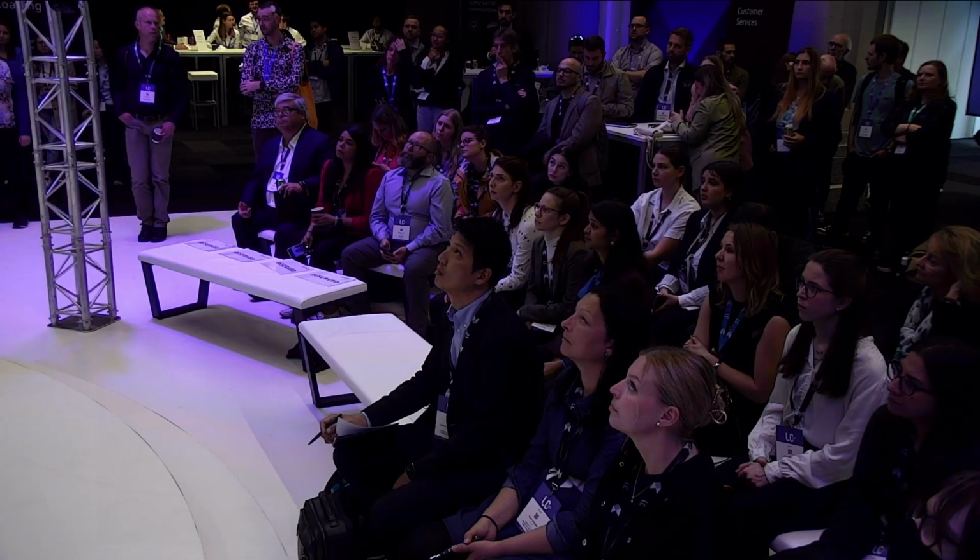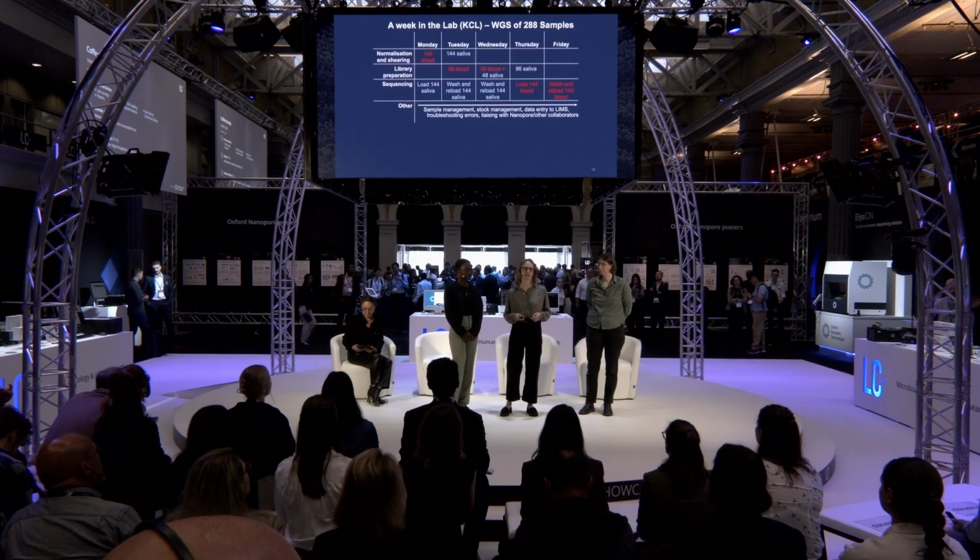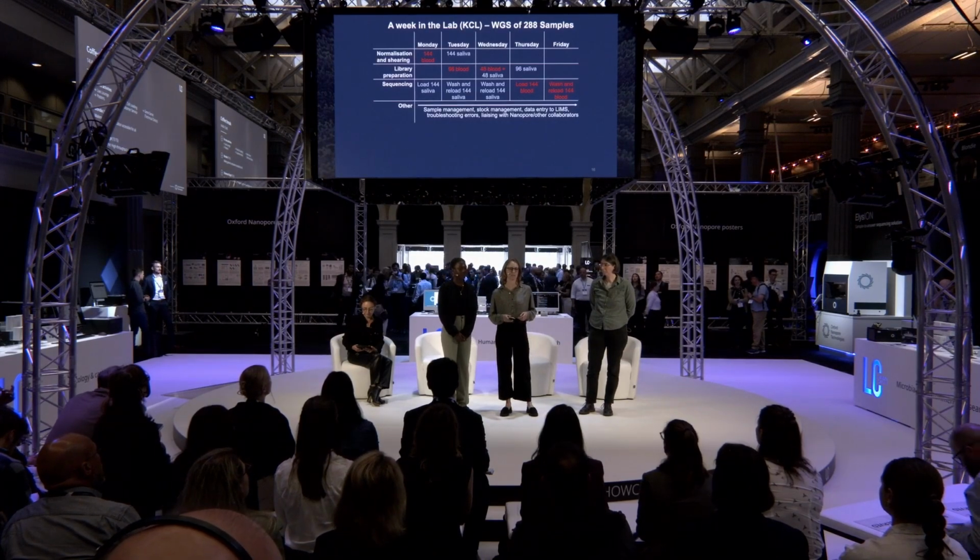So that's receiving samples, organizing and picking the samples, reagent and flow cell management, data entry into our internal LIMS systems, troubleshooting any unexpected experimental outcomes, and also liaising with our collaborators at Cambridge and with ONT about the progress of the project and any upcoming changes.